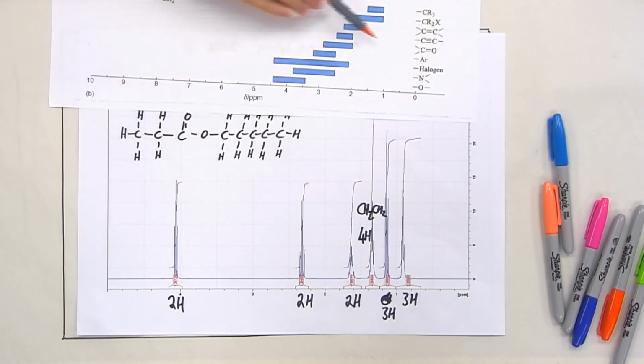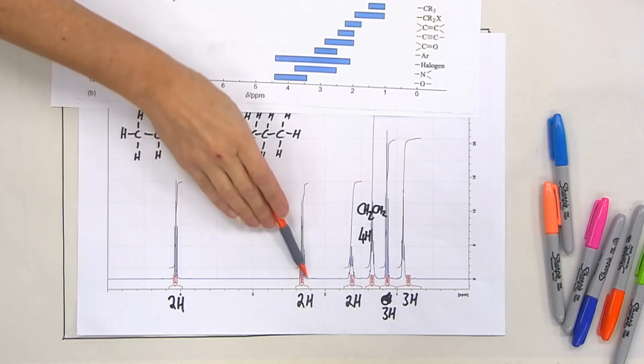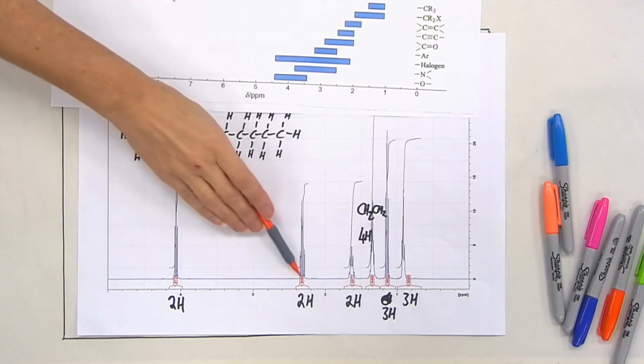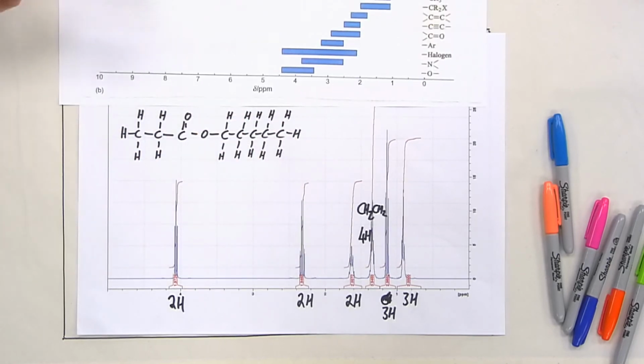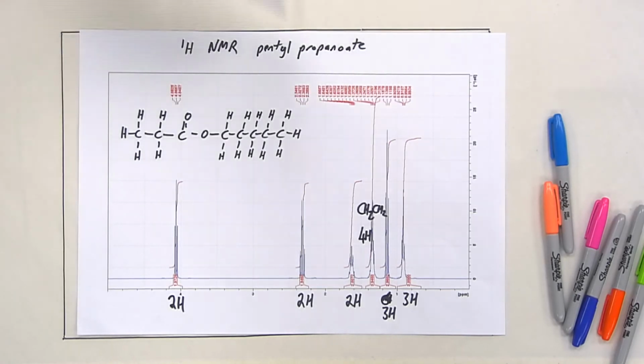For a carbonyl, if we look for the CH2 attached to the carbonyl, I think it's this one here, isn't it? Yep. So roughly between 2 and 3. That's around about 2 1/3 or something, is it? Yep. Okay, so you can see it fits with the correlation charts that we're seeing there. Okay. Right, I think we were going to look at multiplicity.